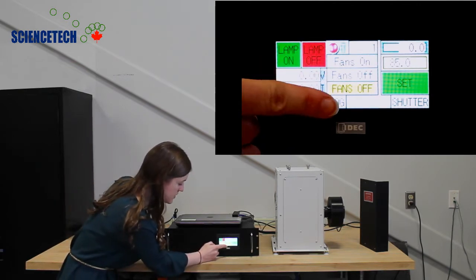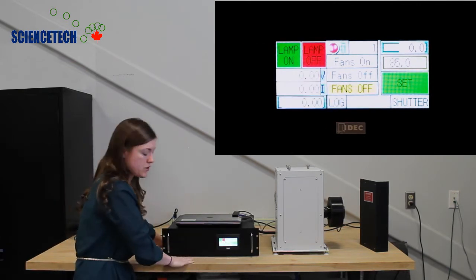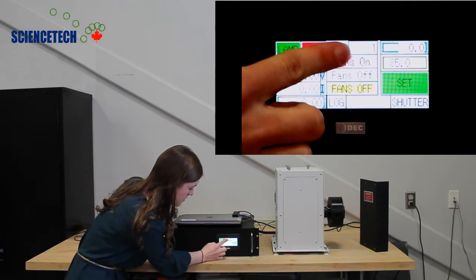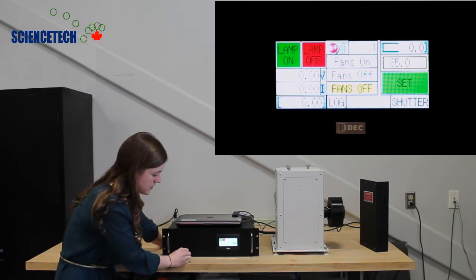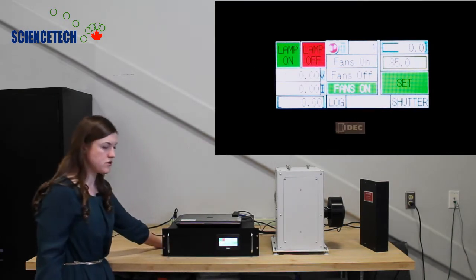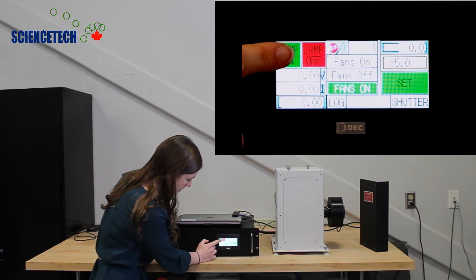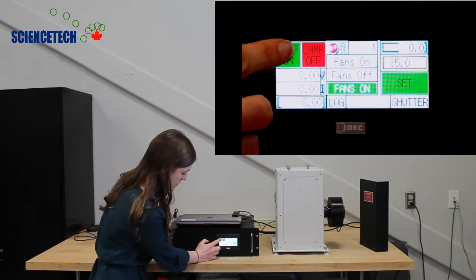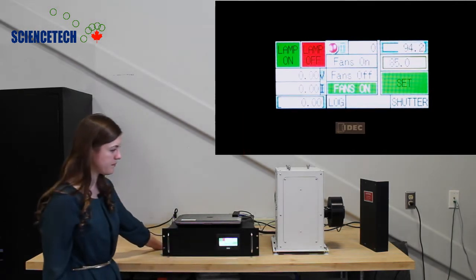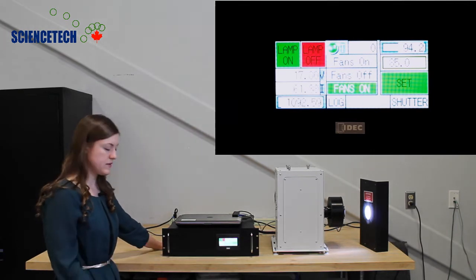The first thing that you should do when you're going to turn the lamp on is turn on the fans. So you hit fans on and the fan monitor changes to fans on. And then you can turn on the light source by hitting lamp on. You can see the lamp is initialized.